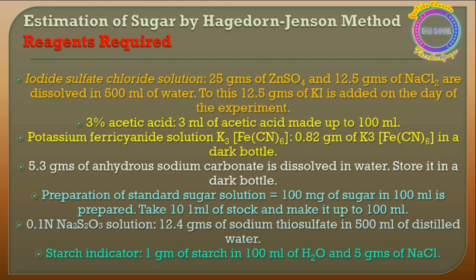Again, we are going to prepare the sugar standard, that is, the standard sugar solution. You know very well that 100 milligrams of sugar is dissolved in 100 ml, and we take 10 ml of stock and make it up to 100 ml.